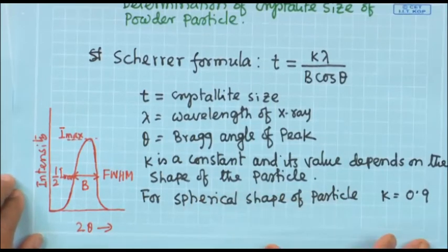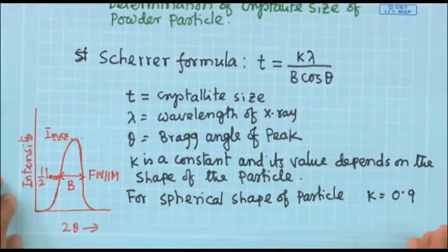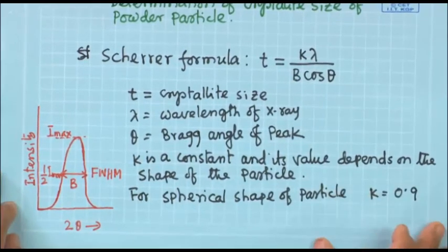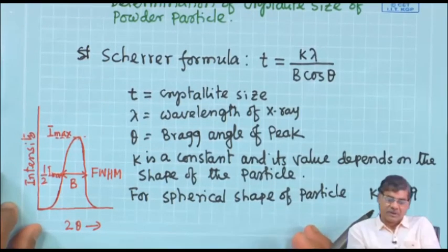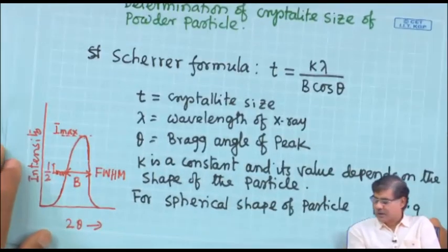You should practice using different XRD patterns, even from the internet, and try to identify the peaks and their corresponding HKL values, and find out the lattice constant and the particle size. Okay. So I think I will stop here.